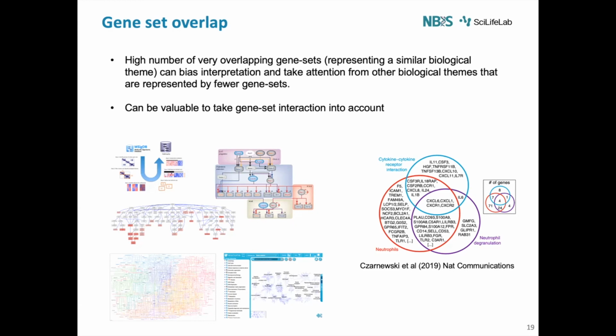So that might be hindered because of these highly enriched pathways. It doesn't mean that the ones that are below do not occur. They are just less preferentially taken into the enrichment scores. So always check for that, so then you're not missing any important biological information. But of course, if they are in the top, there is a reason for that, because their p-values and the distribution or their enrichment scores are actually more significant than the others.